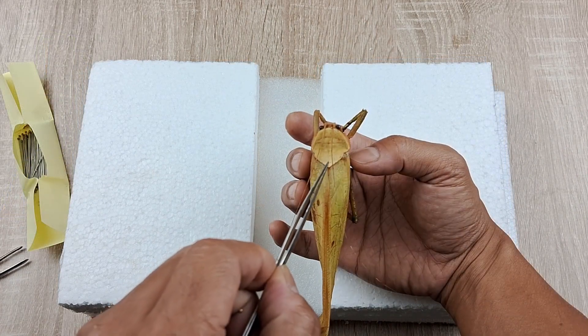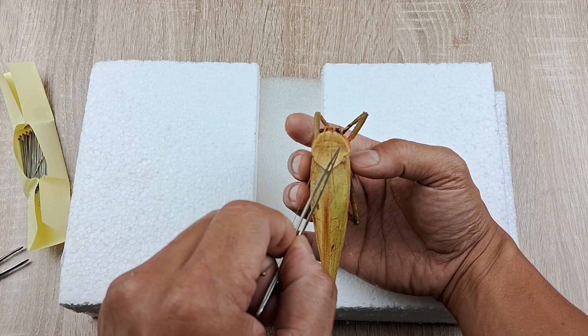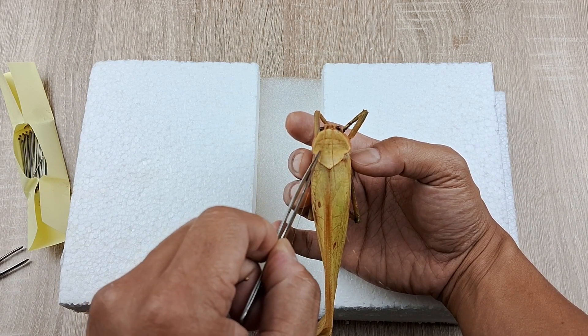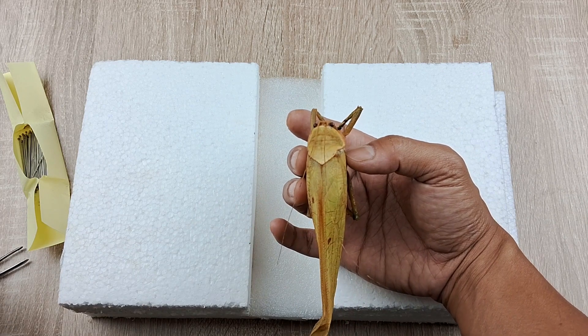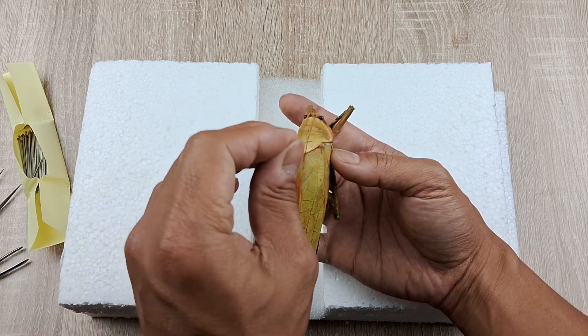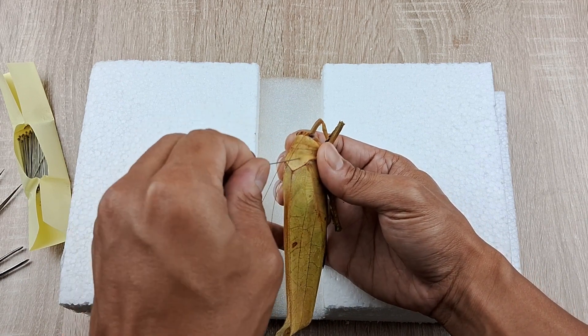Once the frozen specimen has completely thawed, insert a number 7 insect pin through one side of the pronotum of the prothorax as shown here. Insert the pin all the way down right through the entire thorax, leaving a 1 cm length of the pin protruding above the thorax or pronotum.